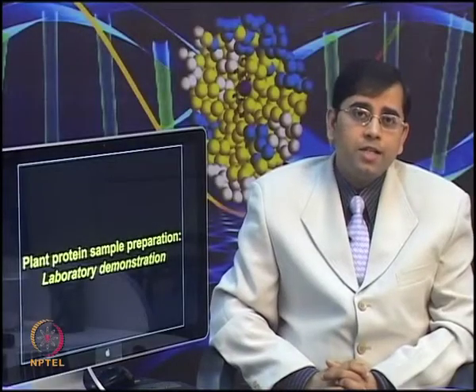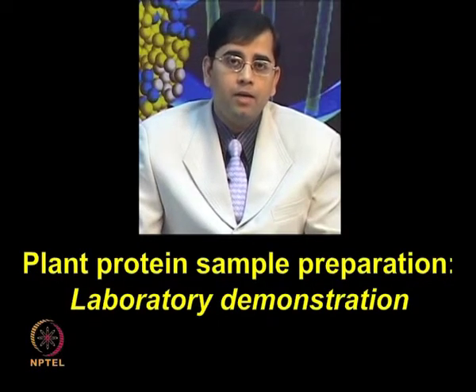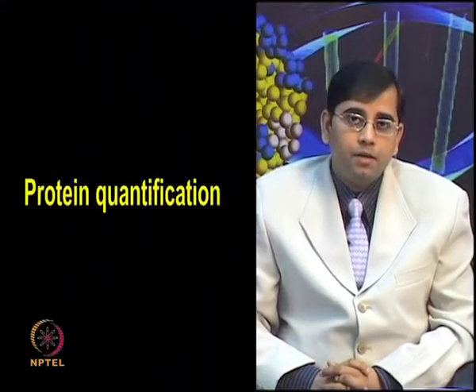Okay, so by watching this video, now you must be familiar with the TCA acetone precipitation method and how it can be effectively used for plant protein sample preparation. So, now let us move on to the next topic, which is protein quantification.